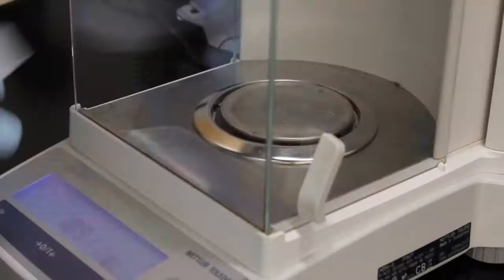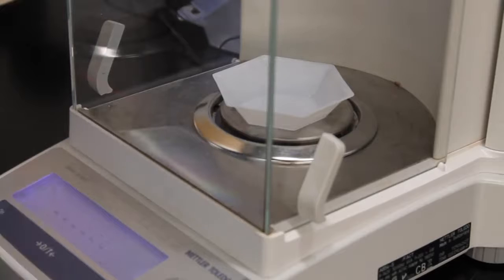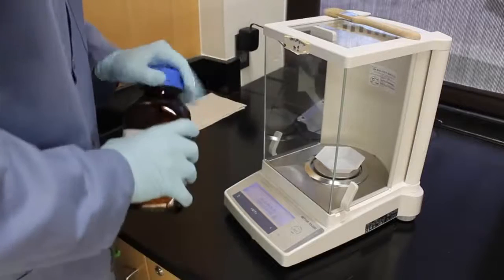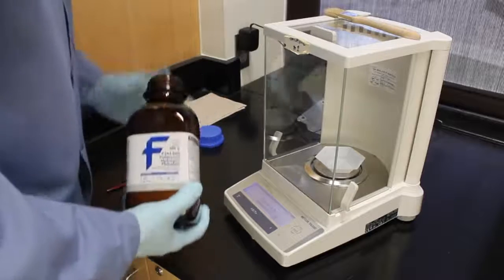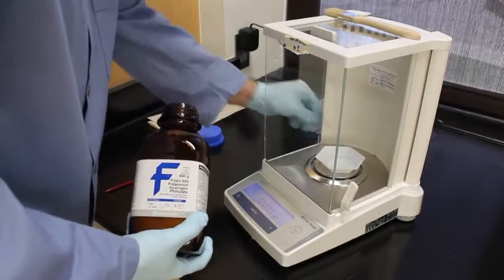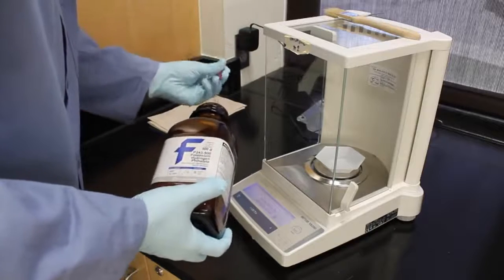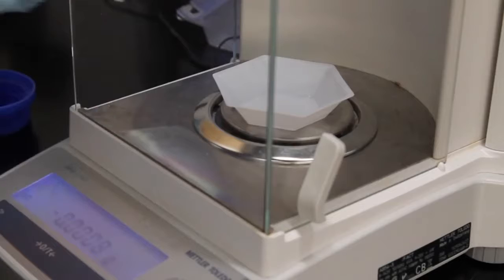I am sure most of you have used a balance before, but remember to zero out the weigh boat before weighing out your KHP. Here I am aiming for 300 milligrams of KHP, but getting exactly 0.3 grams doesn't matter all that much, as long as I am close. This may take a while to get close to my desired mass.